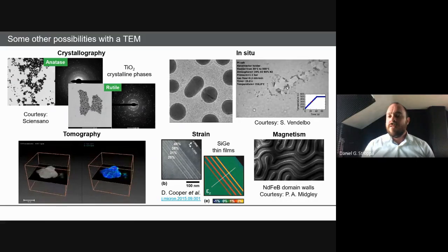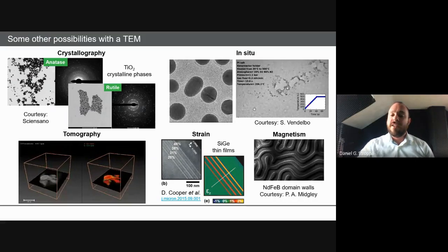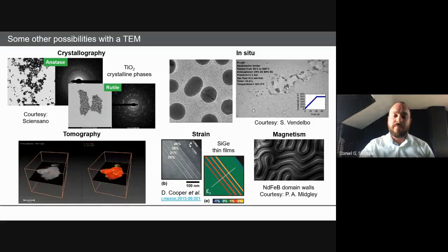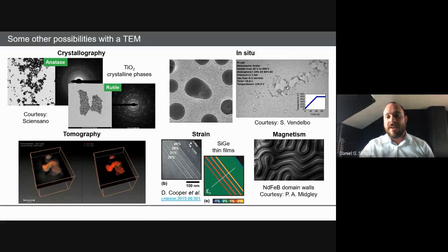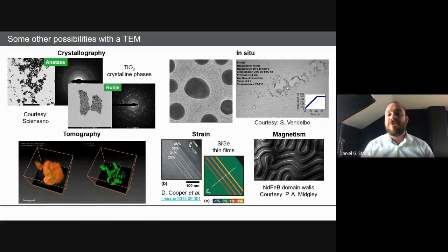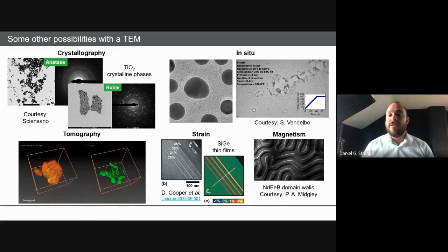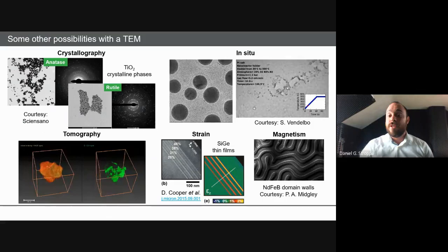Then a brush on the theory. I think that this is the starting point if you want to understand what is possible to do with a TEM, is to understand the scattering events that you have when you have a high energy electron beam going through a thin specimen. So the first thing that you expect to have is that many electrons are not going to scatter when going through the sample.